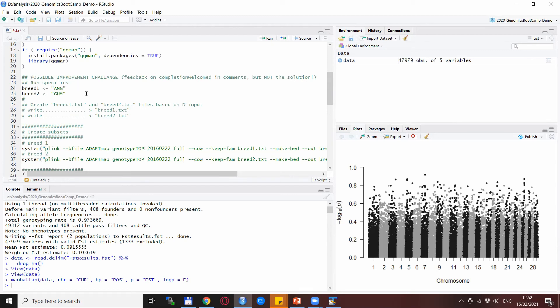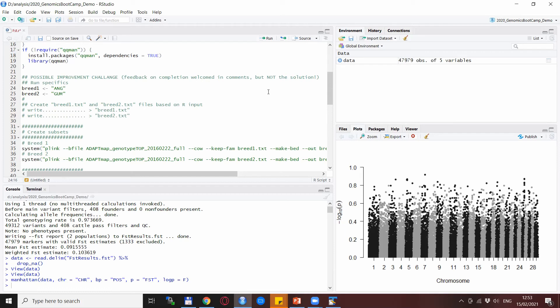My small challenge to you is to try to write these two lines. Of course, just not to take away the joy of discovery from others, I welcome the feedback on completion in the comments for this video, but please do not place the solution there so that others can also play around a bit and find it out on their own.